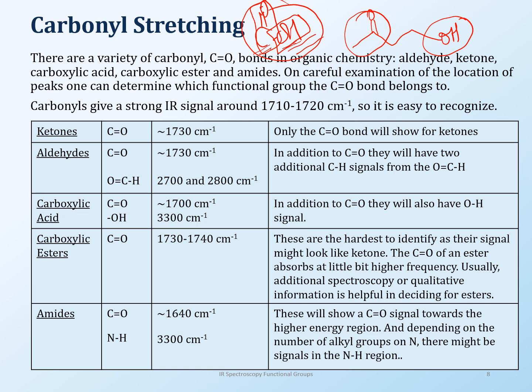Esters are going to be a little bit misleading. As I said, these are the hardest ones because they only have the carbonyl, just like a ketone. The only thing that will help you here is if you have a molecular formula. Ketones only have one oxygen, esters have two oxygens in them. So that can help you if you have the molecular formula. But otherwise, you need other techniques to help you. Ketones and carboxylic esters are going to give you a bit of a run in case you don't have any other information.